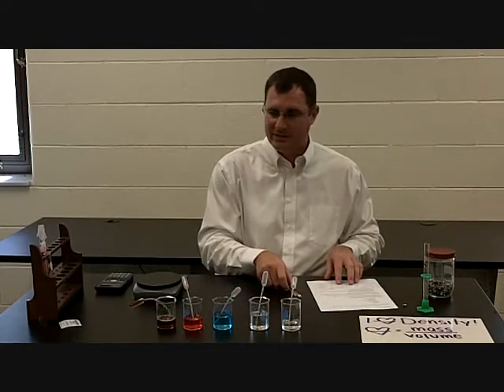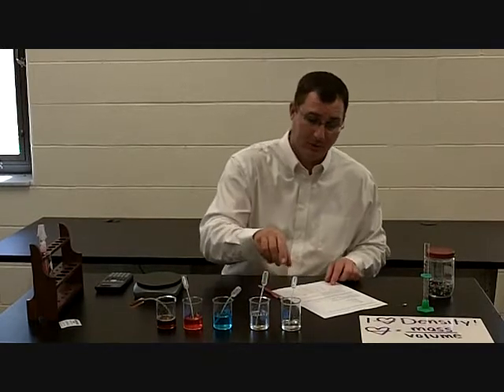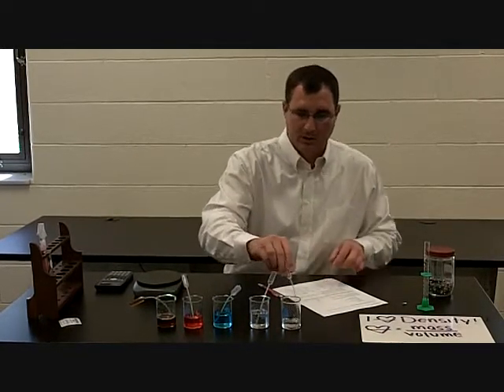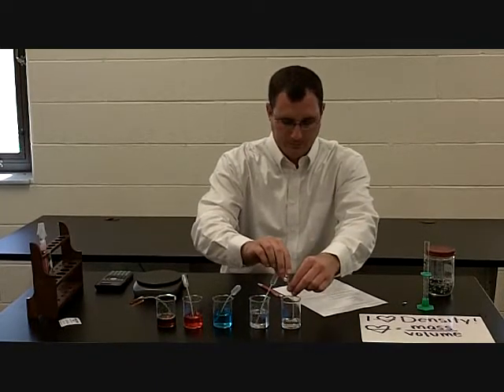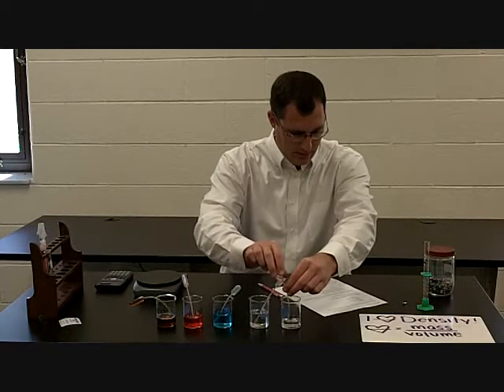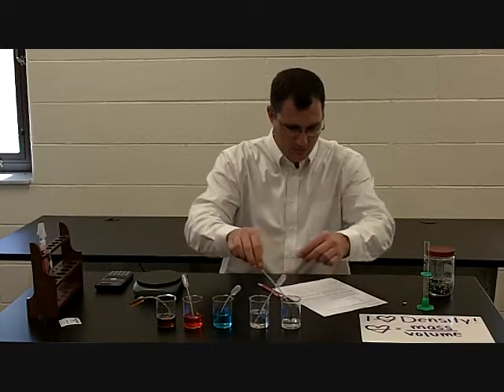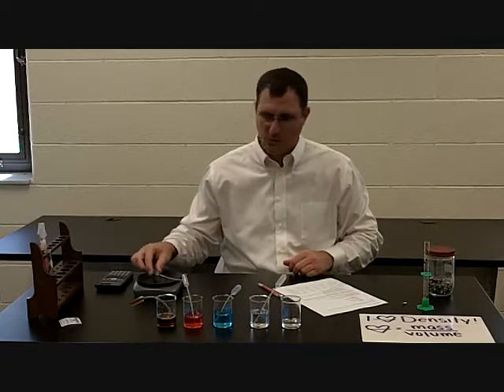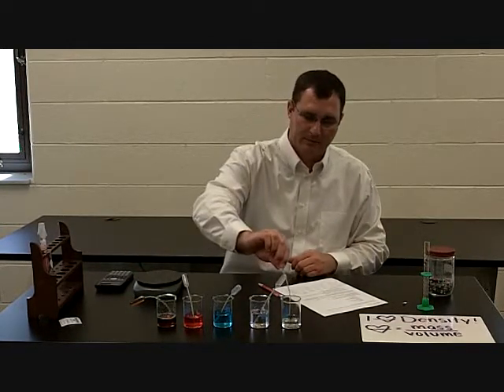Let's go ahead and find the density of these other fluids up here. The first one we have is isopropyl alcohol. So I'm going to fill the pipette all the way up, and when I put it up here, it weighs 4.7 grams.